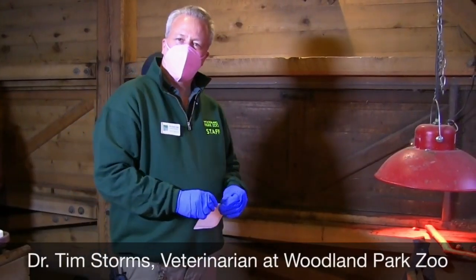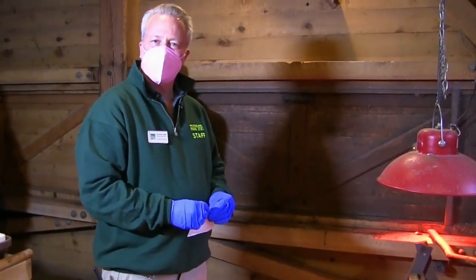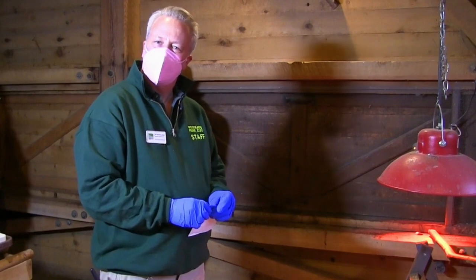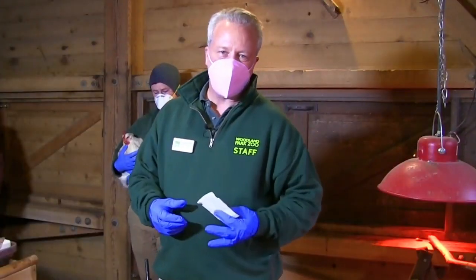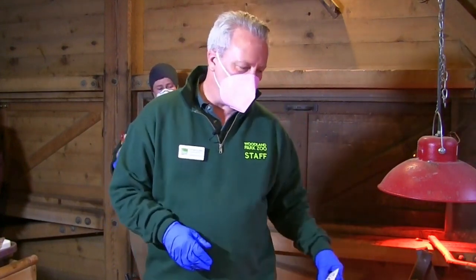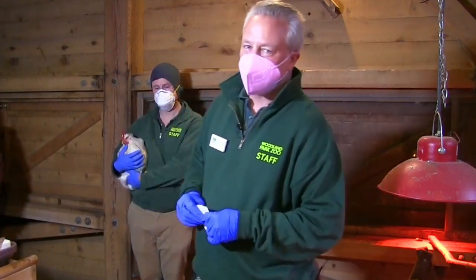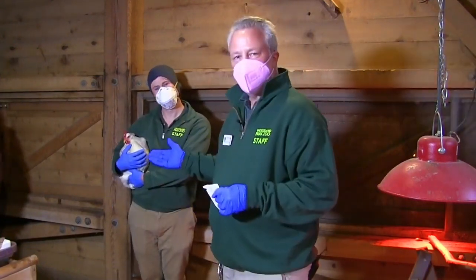Hi, I'm Dr. Tim Storms. I'm a veterinarian at the Woodland Park Zoo, and I'm going to show you how to take sample collection for disease concerns for bacterial culturing. First, I'm going to take some samples of the environment — the food, water bowls, and then the substrate or bedding. I'm going to take a sample of feces, and then we're going to take a sample of our chicken, Miss Betty.